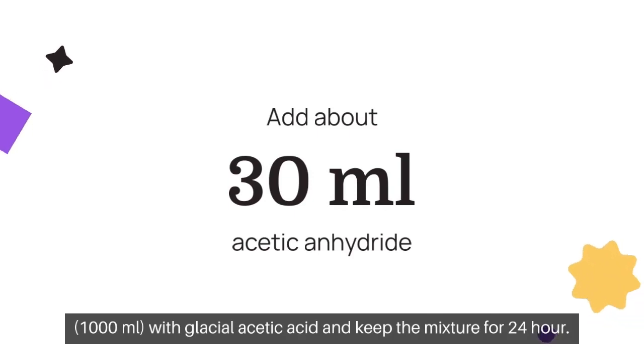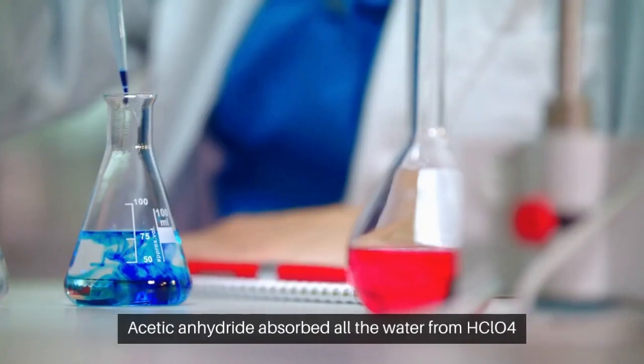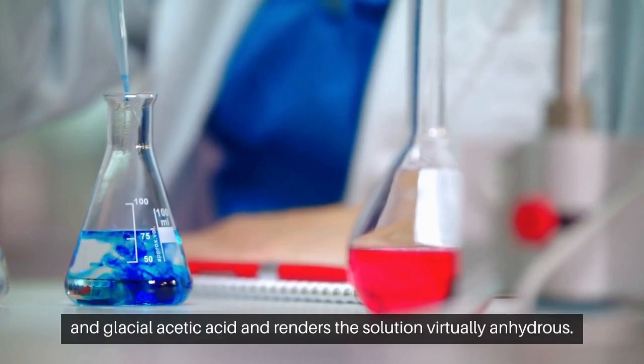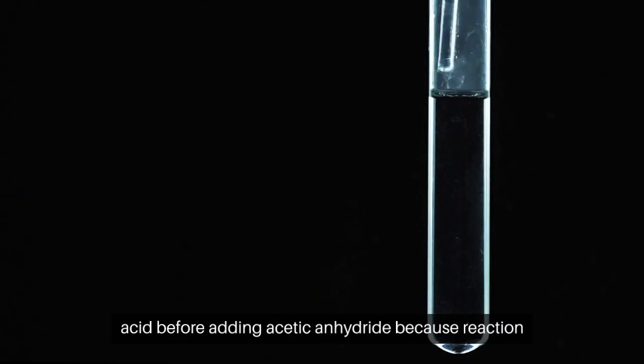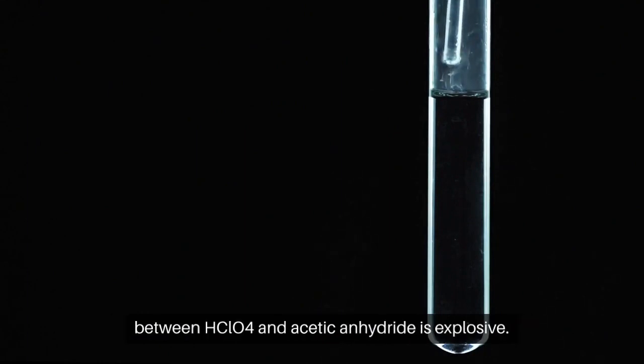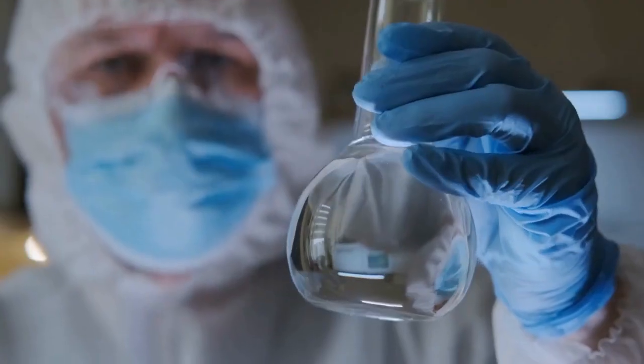mixture for 24 hours. Acetic anhydride absorbs all the water from HClO4 and glacial acetic acid and renders the solution virtually anhydrous. HClO4 must be well diluted with glacial acetic acid before adding acetic anhydride because the reaction between HClO4 and acetic anhydride is explosive.